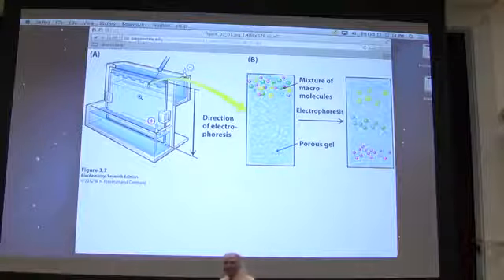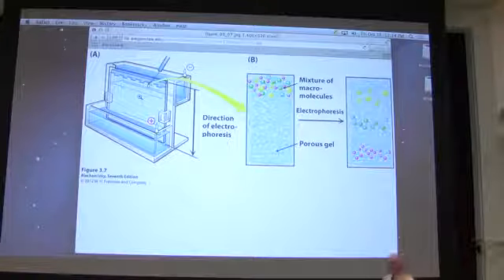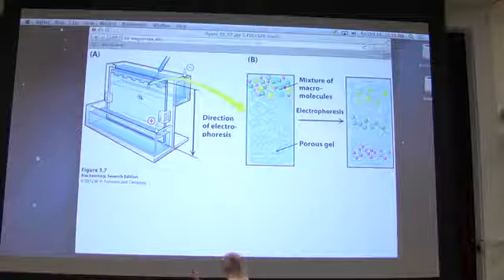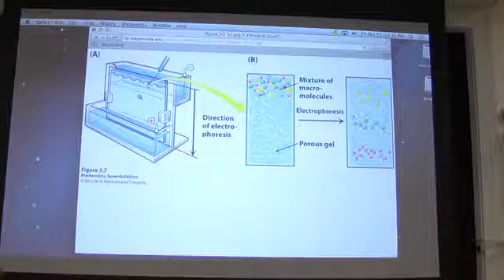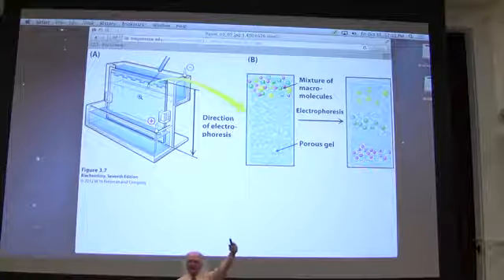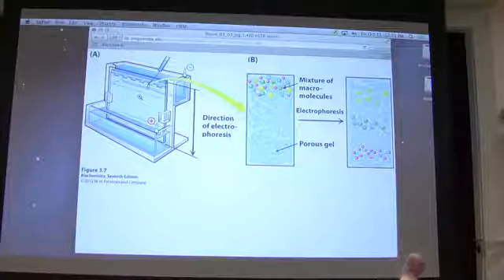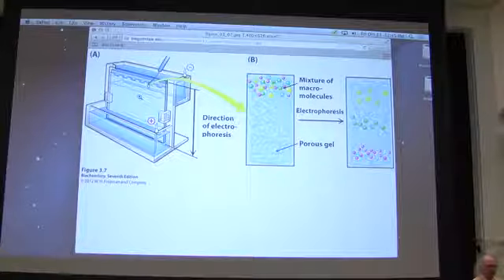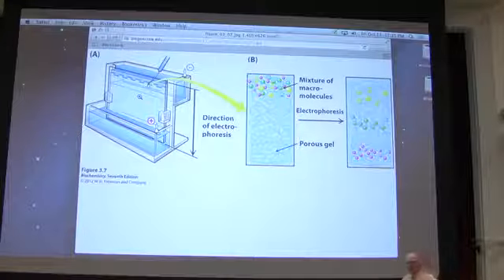Then we close this all up and we apply an electrical current to it. And when we apply an electrical current, we make it so that the negative is at the top and the positive is at the bottom. I'll tell you why in a second. What's going to happen is electricity is going to flow and it's going to move from top to bottom, making a circuit. Now, the reason we put minus at the top is DNA is full of phosphates. There's a phosphate between every nucleotide, and phosphate is negatively charged. DNA is a polymer of negative charge. DNA forms nice rod-like regular structures, and the longer the DNA molecule is, the more negative charges we have. The length is proportional to the negative charge.